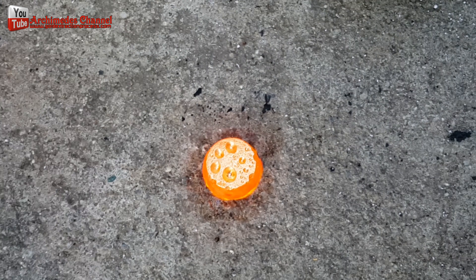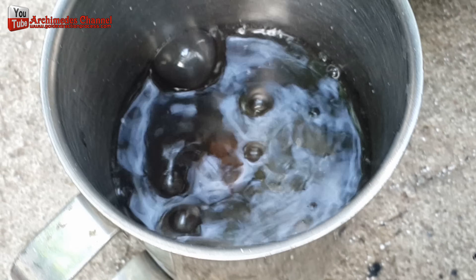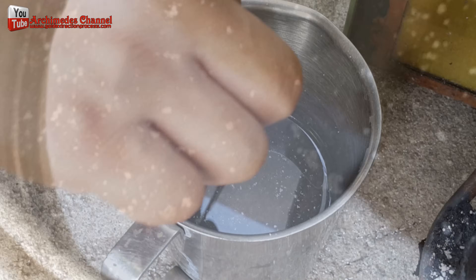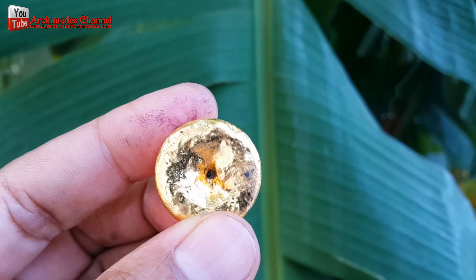I placed the hard but still hot gold particles into a mixture of two parts nitric acid and one part water. This solution further cleans the gold particles. These are the gold particles removed by this process. I was so delighted to see the results of my work.